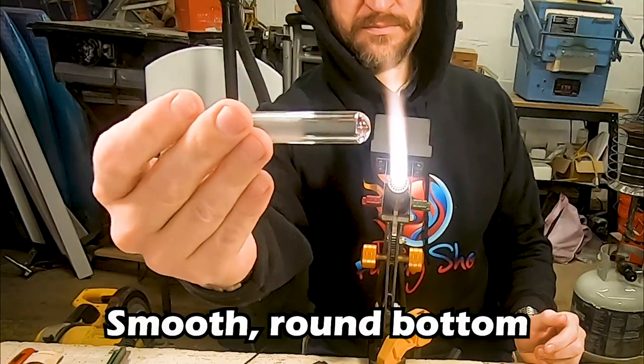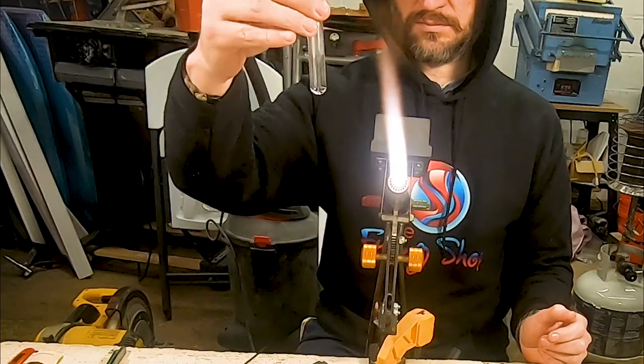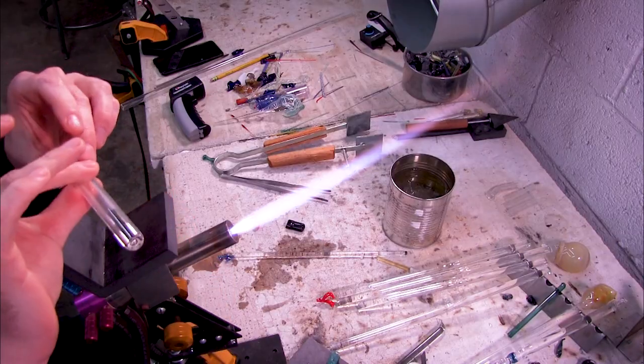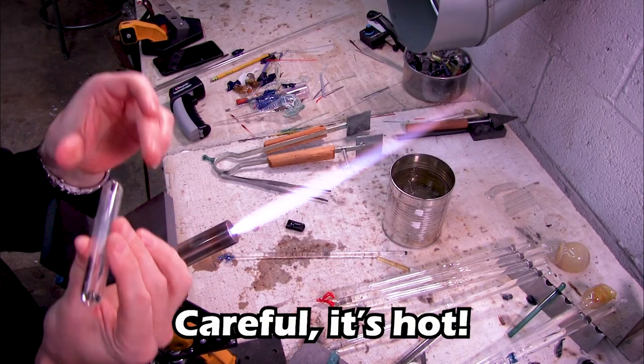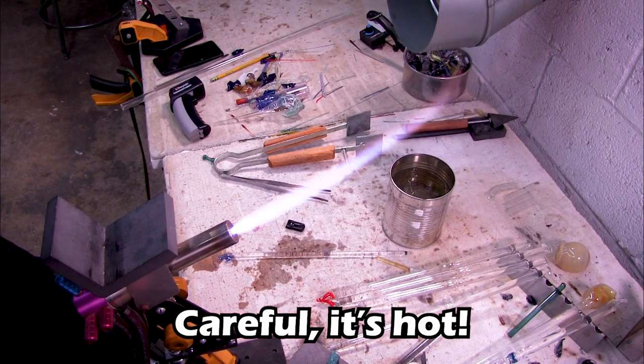I just want to add a word of caution: if you are doing this the way I am, be very careful when you transfer the glass from hand to hand. The clear glass does cool off, but it's still ripping hot, so be careful not to burn those precious digits of yours.